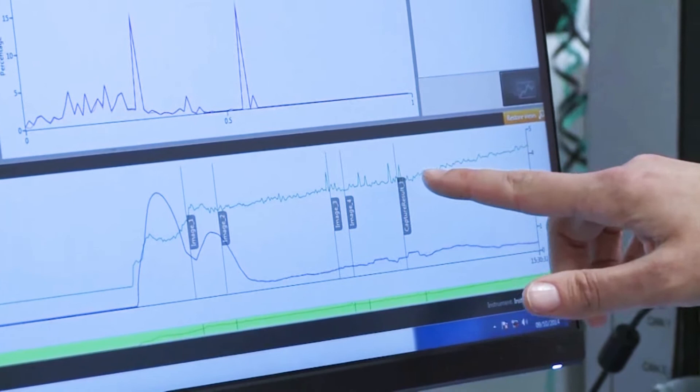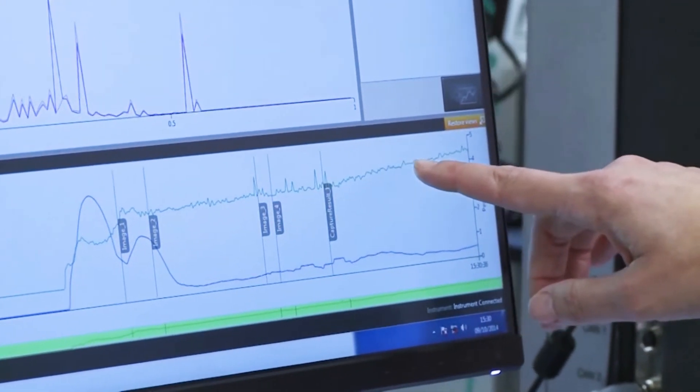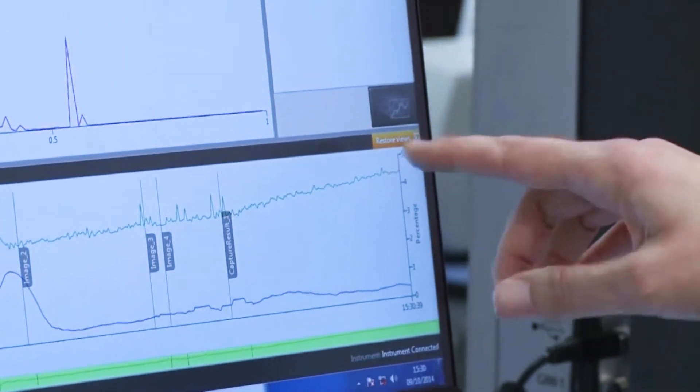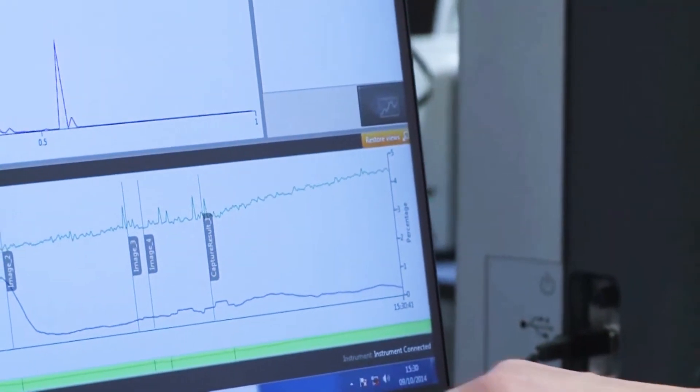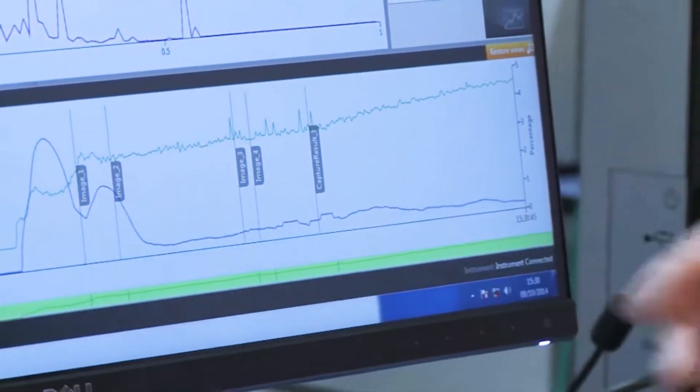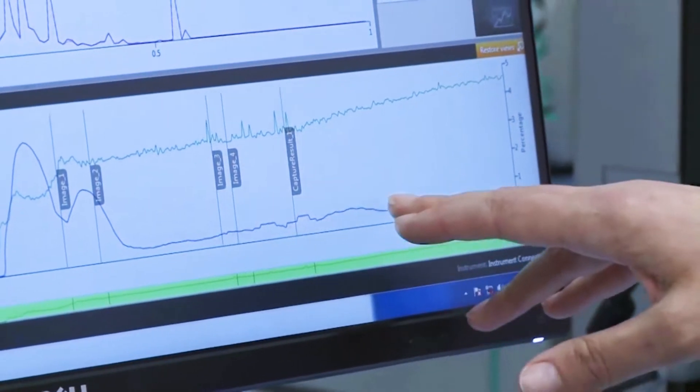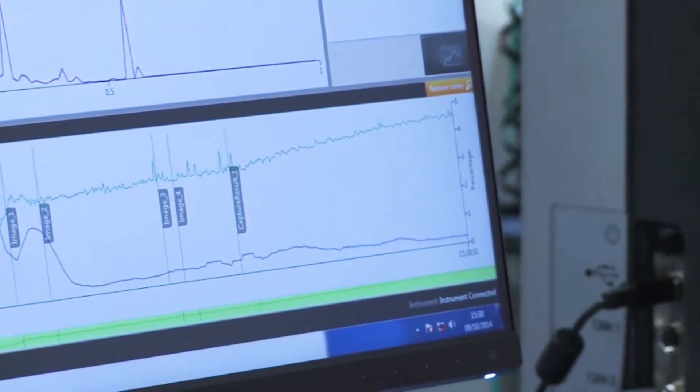So the dispersion index is here in green, and since Anne has turned on the ultrasound, we can see it starting to steadily increase as those particles are being dispersed. You also have the RSD of the dispersion index, which is looking at a rolling set of frames and seeing if there's a change. And there was indeed a small change here as we turned on the dispersion.